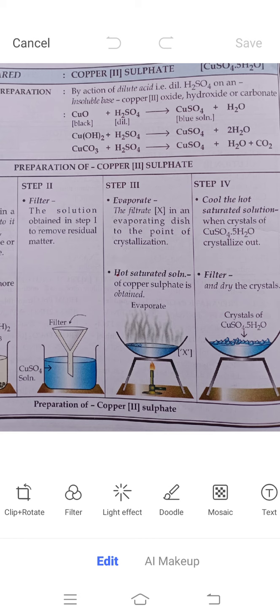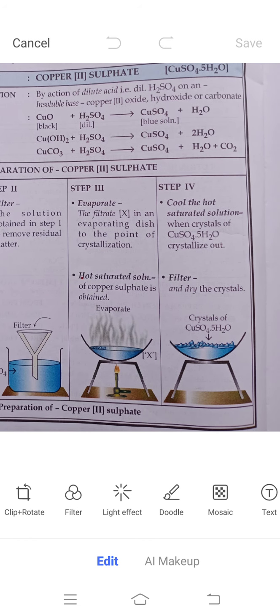In step three, we are going to evaporate the copper sulfate solution. Why do we evaporate? Because on evaporation water will get removed and the left behind will be our product, copper sulfate. Here the filtrate is in an evaporating dish heated to the point of crystallization, so hot saturated solution of copper sulfate is obtained.